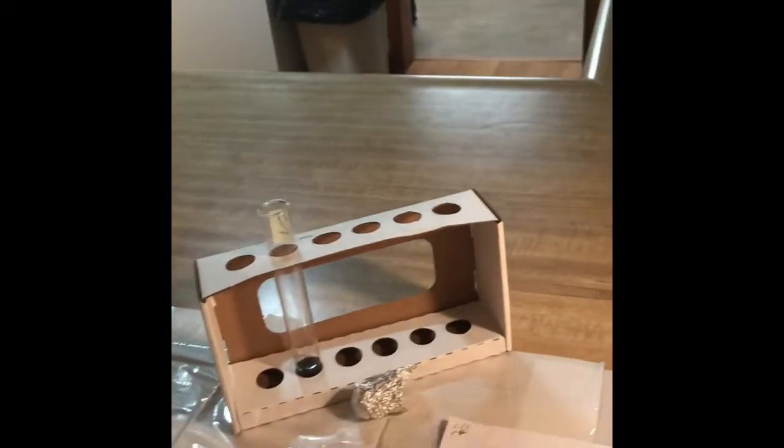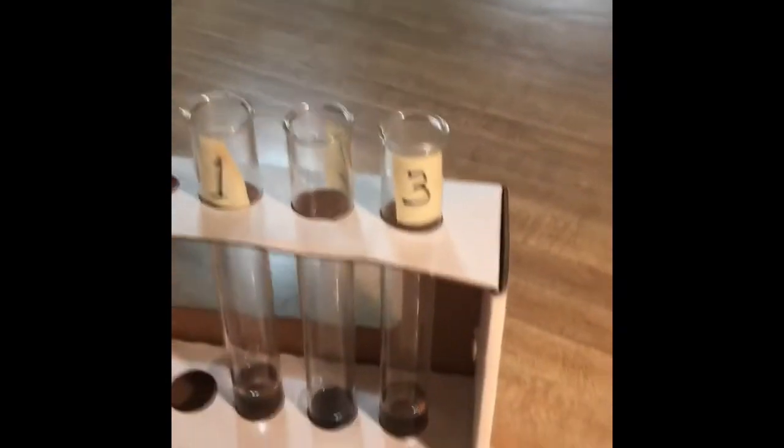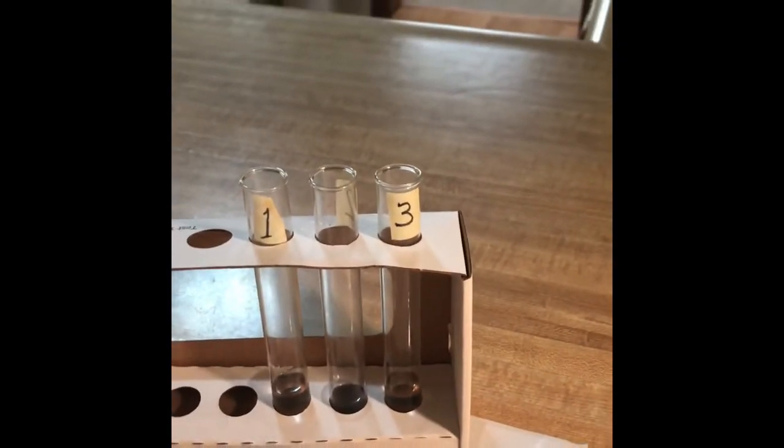This concludes the actual experiment for Lab 16, with the solutions in all three test tubes being purple at the beginning of the session under the incandescent bulbs. The length of time required for the solutions to turn clear being 7 hours, and test tube 2, which received no light, being the same purple at the end of the experiment as it was in the beginning.